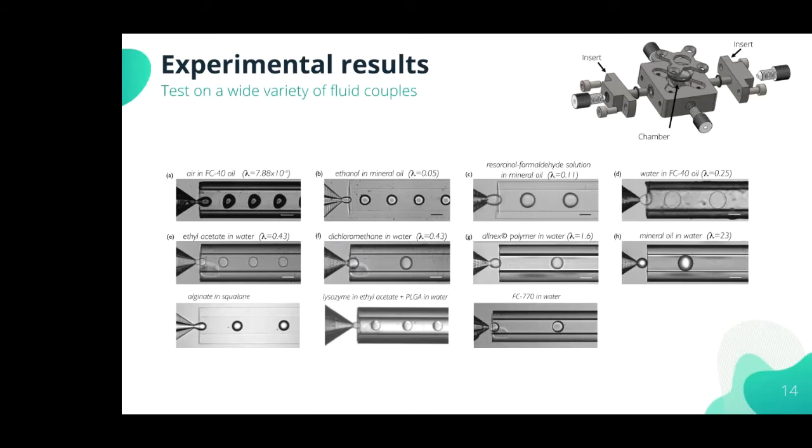We finally showed the versatility of the device by generating droplets of a wide variety of fluid couples: water in oil, oil in water, organic solvent in oil, organic solvent in water, polymer, alginates, etc. And again, without coating needed, so all these droplets can be generated using the same device, provided that we clean it carefully before testing new fluids.